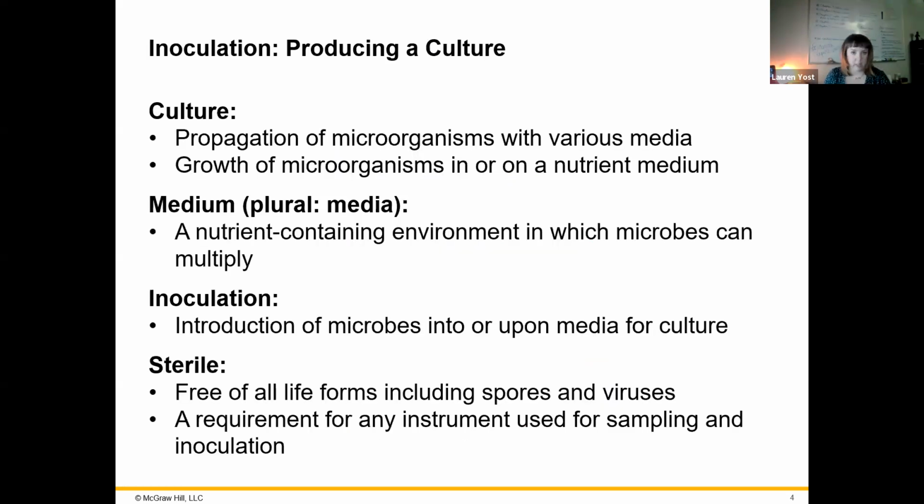Okay, inoculation. So going to the first I. Inoculation, we're going to prepare a culture using sterile media and a nutrient medium. So just in general, you're going to start with something that can probably grow most things, because you don't know much about your unknown causative agent. Medium is the singular and media is the plural.